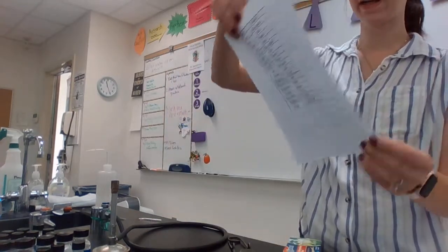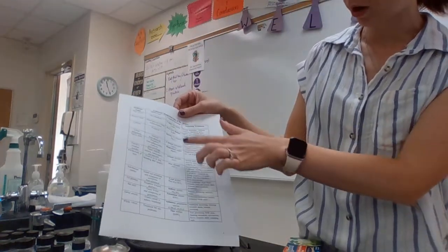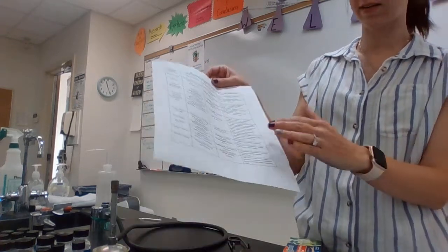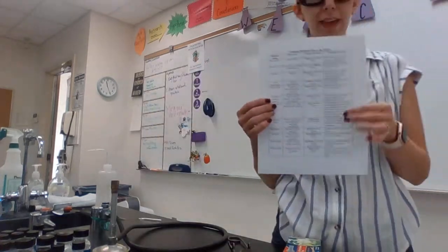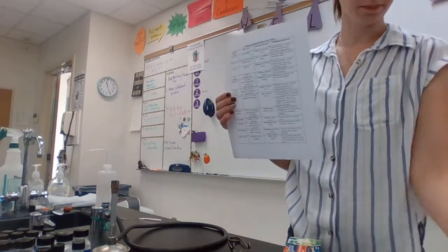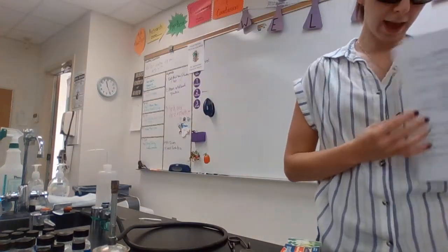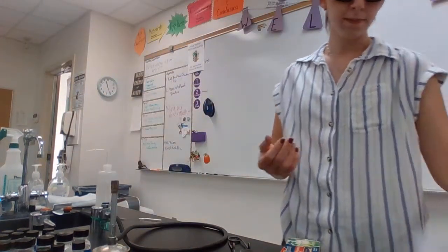So then you'll look at the back and you'll see, okay, what has copper, boron, mercury, calcium, magnesium, some different things on here that might be those colors, and see if that matches up with the initial reading of the prognosis. You'll see which one matches with which. And then using that, you'll answer your question.